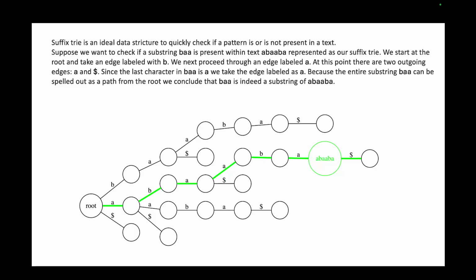So in our case, this whole trie will be made up of your reference genome, and when you're trying to find a particular read inside the reference genome, you start from the root, and one by one in the sequence, you try to go from one node to another. And if you can go from the root to a particular node inside the suffix trie and cover the whole read that you are trying to find, then you can conclude that that read is present in your genome.